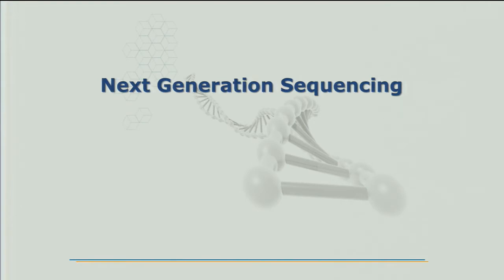Okay. So, now we talk about next generation sequencing. Again, it is sequencing actually. The word next generation has been put there to make it more fancy.